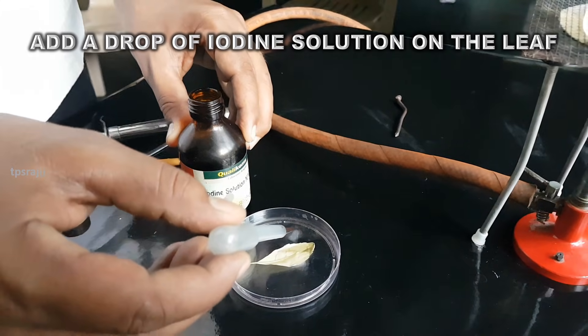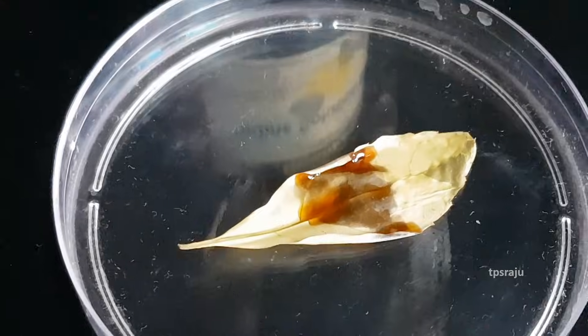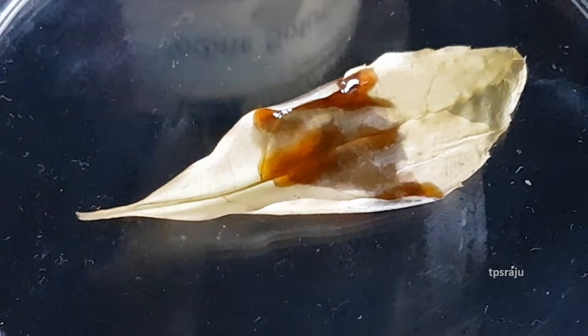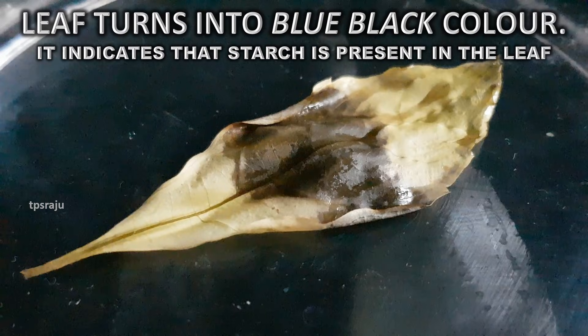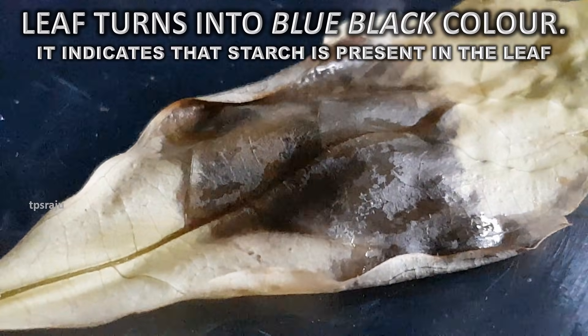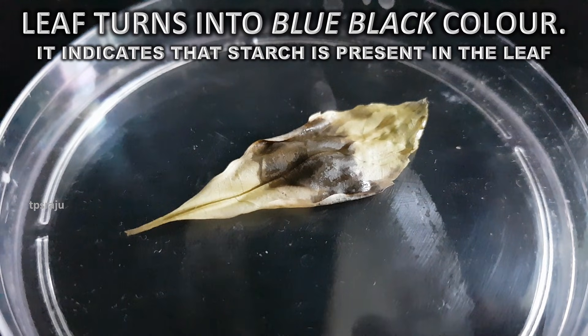Add a drop of iodine solution on the leaf. Observe carefully. Is there any color change in the leaf? Yes, the leaf turns into blue-black color. Why does it occur? Already we know that iodine solution is the starch indicator. Starch gives blue-black color in the presence of iodine solution, so this color change indicates that starch is present in the leaf.